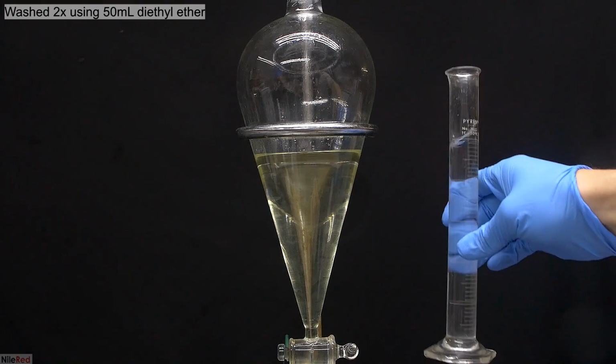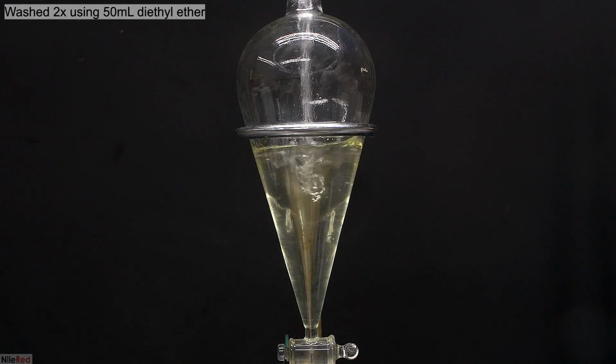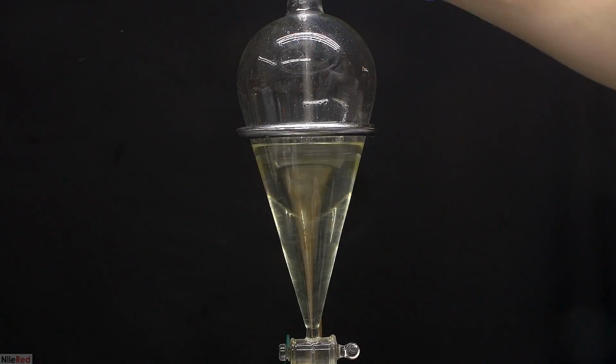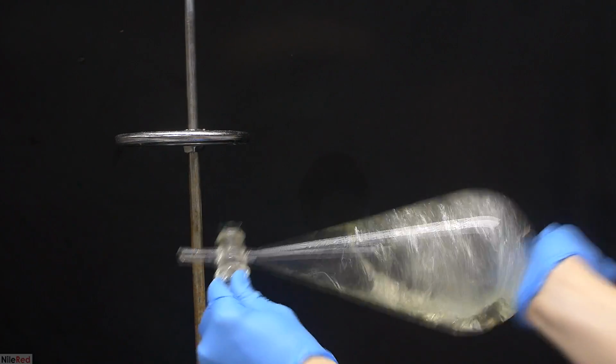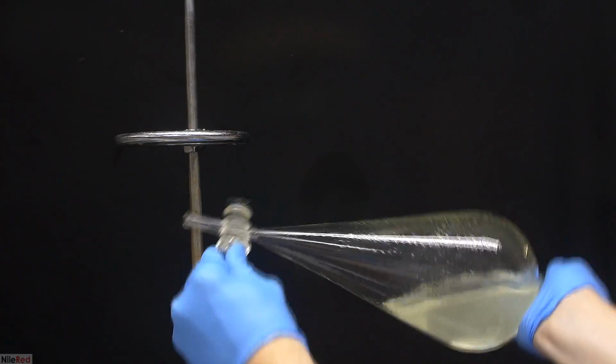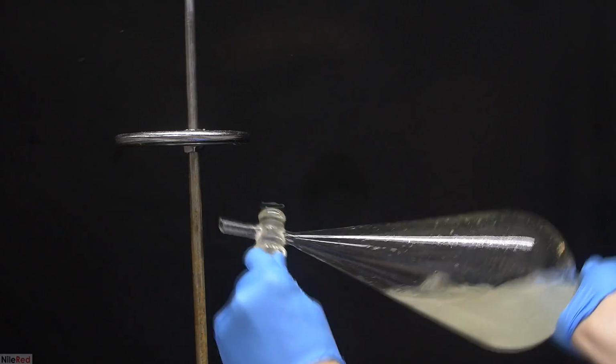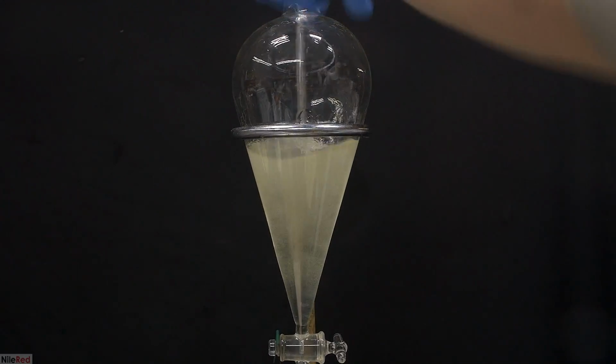The extraction process is pretty simple, and we start off by adding our extraction solvent, which is 50 milliliters of diethyl ether. Once the solvent's added, we take it off the stand, we cap it, and we shake it vigorously with frequent venting. Once we feel like we have an adequate mixing of the aqueous layer and the ether, we can place it back on the stand and allow the layers to separate.